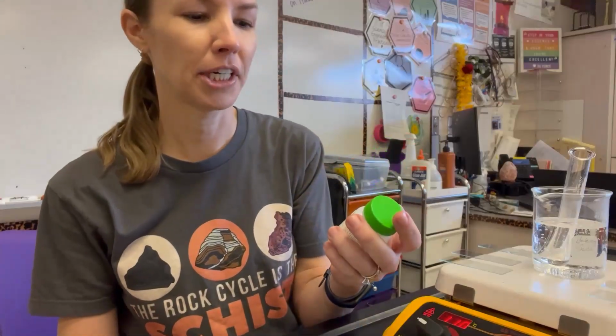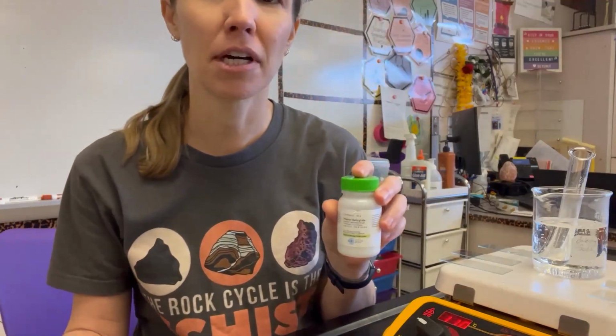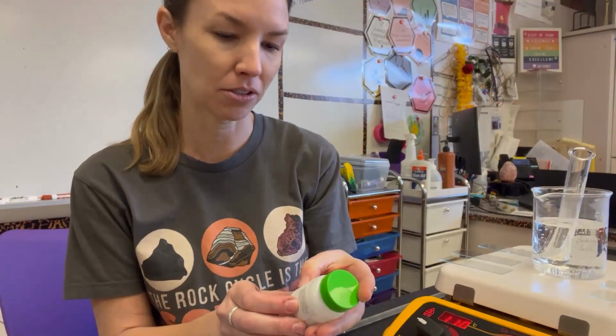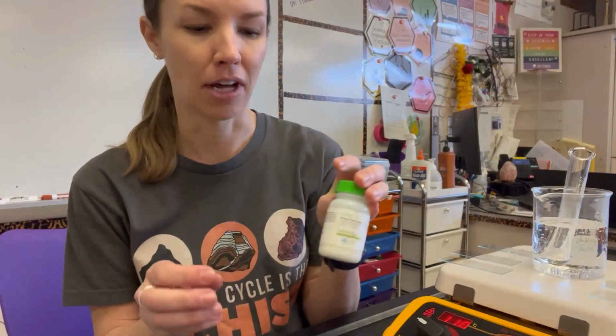You're going to need to order a chemical called phenyl salicylate, or salol, as it's sometimes commonly called. I have not seen it on Amazon, but you can order it from science suppliers. I ordered this sample from Home Science Tools. It's 30 grams, and it has lasted me years, and it's still way more than halfway full. So you do not need a lot.